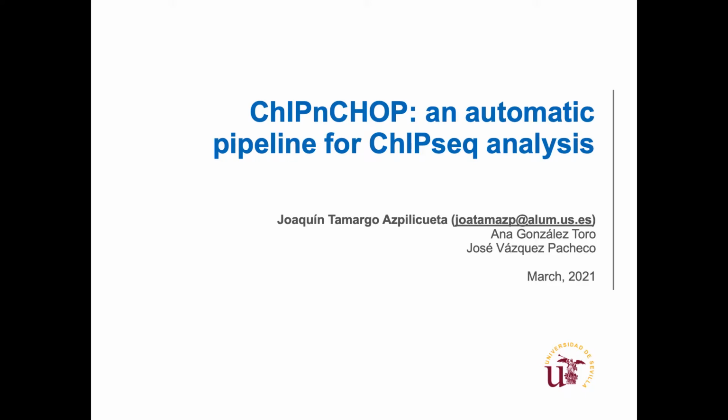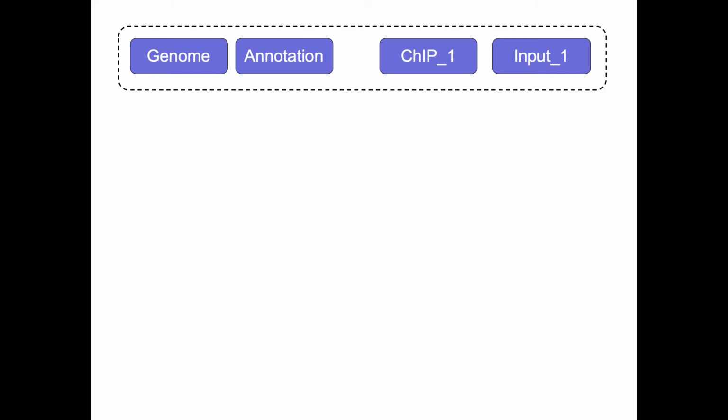In this short video, I will teach you how this pipeline works in a few words, what inputs it needs, and what outputs you may expect to have using it. So, in first place, what does it need?